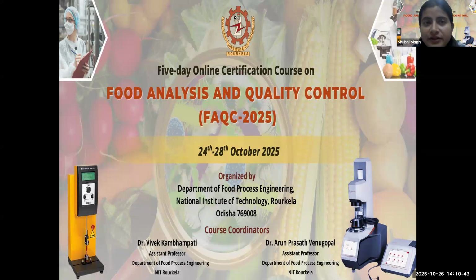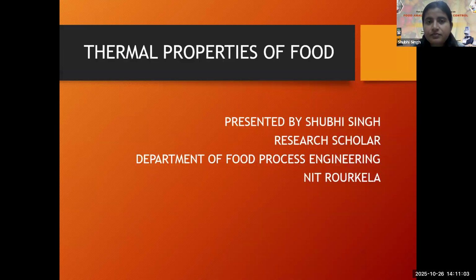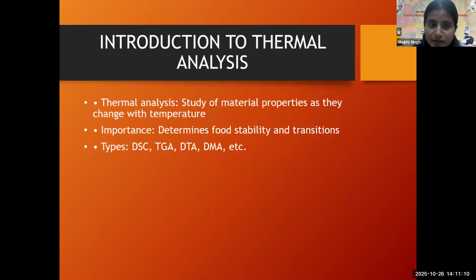Okay. So, good afternoon, everyone. My name is Shubhi Singh, and we will be having a lecture on thermal properties of food and rheology of food. So, starting with the thermal properties, we will be presenting on the topic of differential scanning calorimetry. Okay. So, introduction to the thermal analysis.